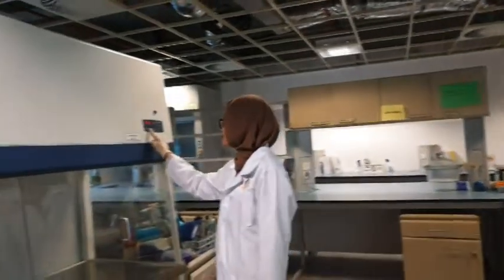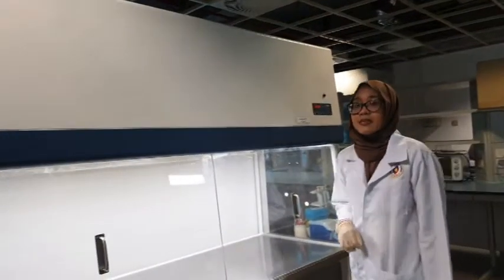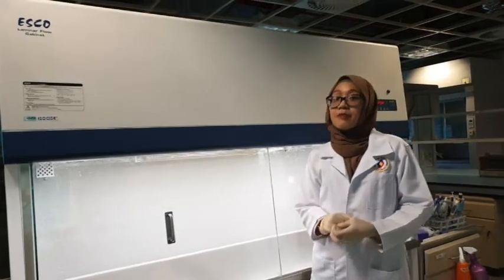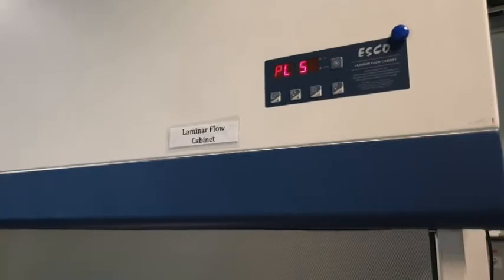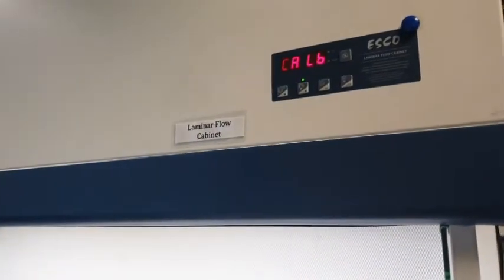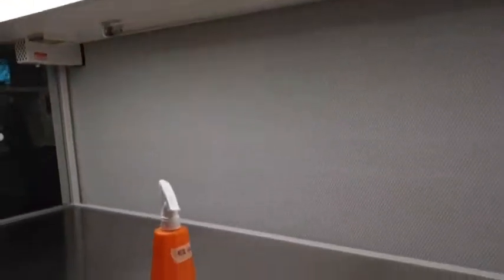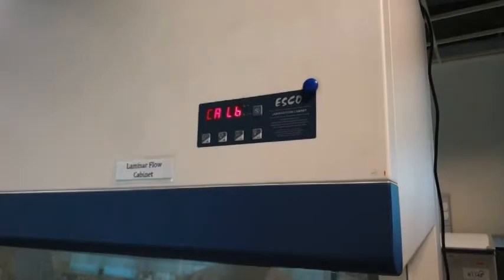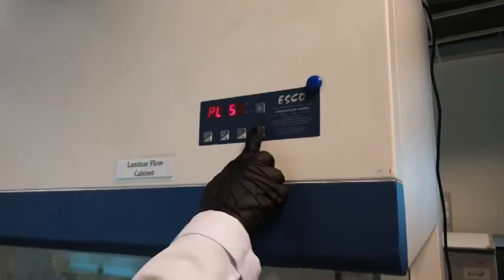All the preparation and sampling for the fermentation will be done in the laminar flow cabinet. This is because the air inside the laminar flow cabinet is filtered, which can prevent contamination in our sample. To use the laminar flow cabinet, firstly, you need to turn on the light, turn on the fan, then sanitize the working surface by using 70% alcohol. Turn on the UV light for disinfection purposes.